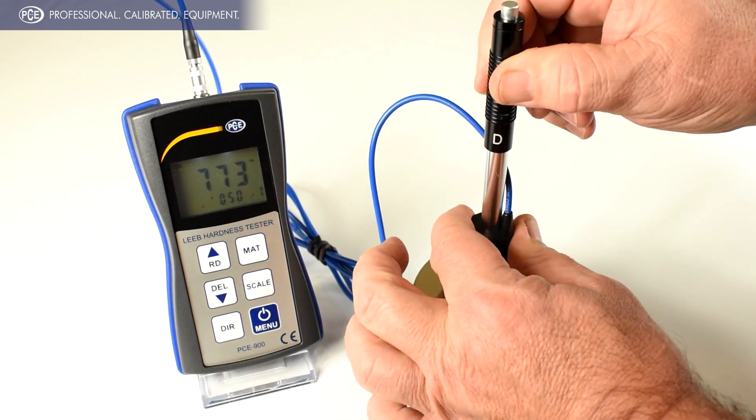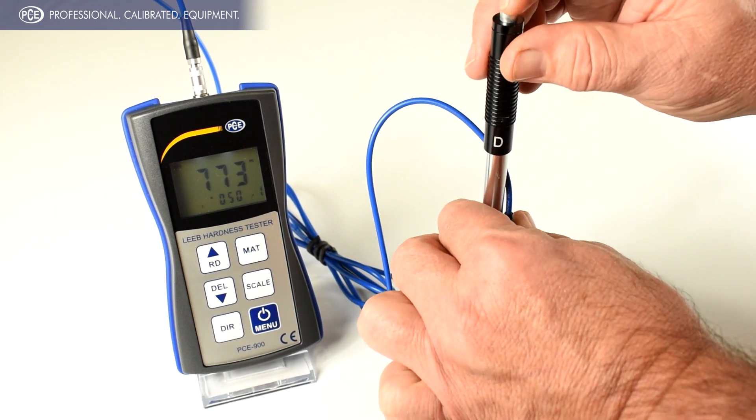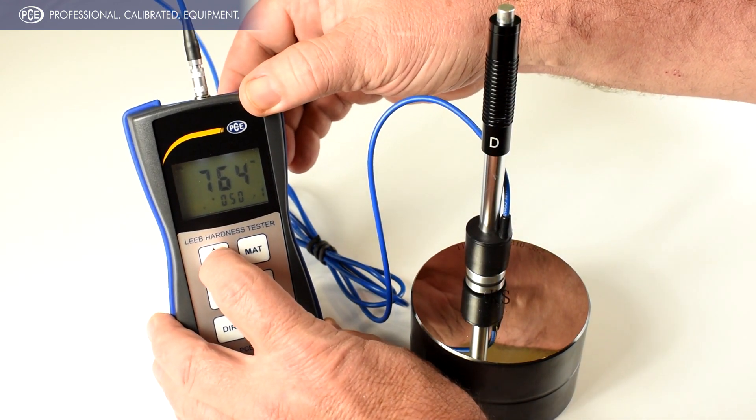We're going to take a measurement of this 775 HLD test block. It's 761, so we're going to raise it to match the 775.